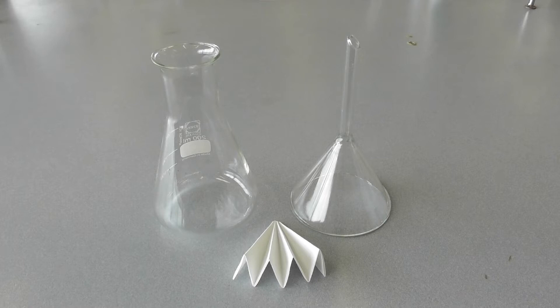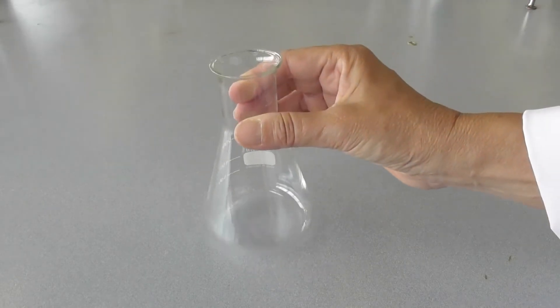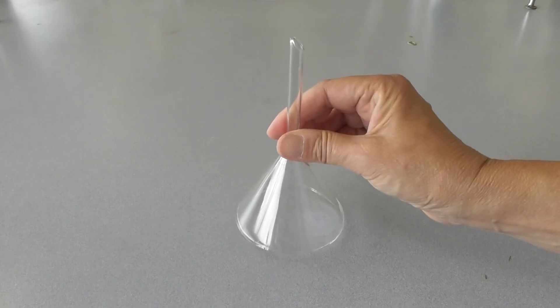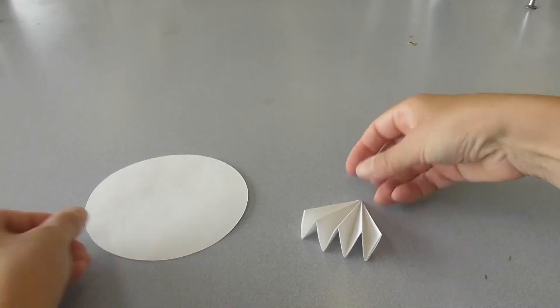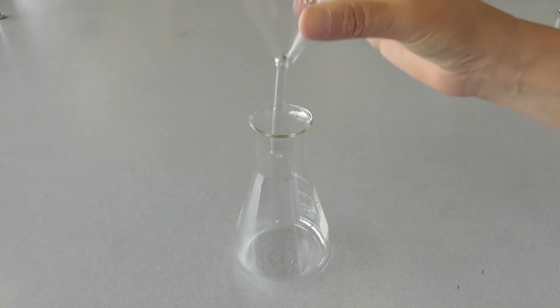Setup is simple, requiring only a conical flask, a funnel and a piece of filter paper. Place the funnel into the mouth of the flask.